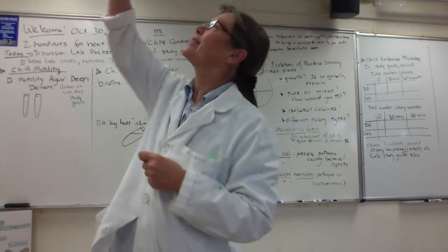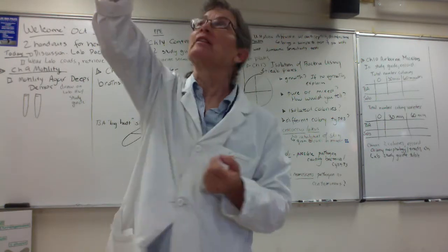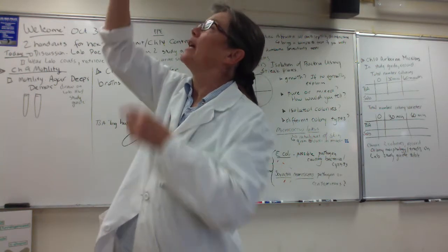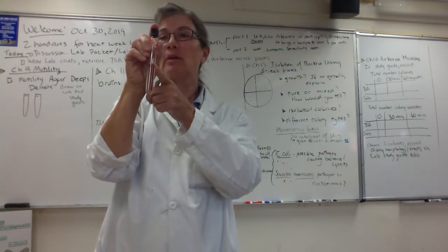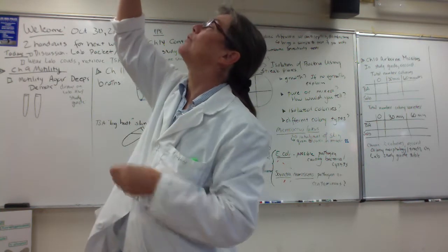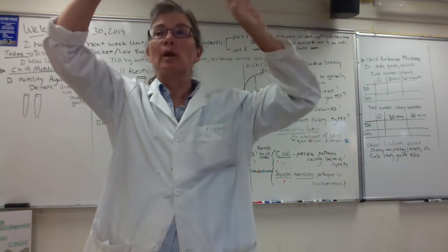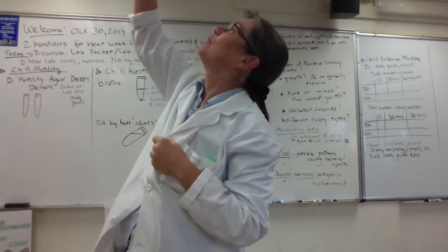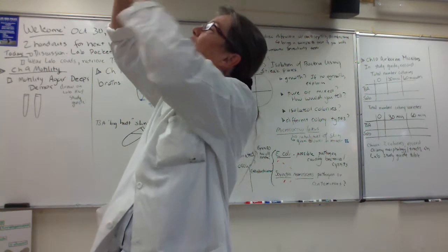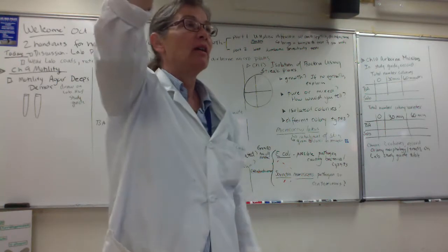But with regard to the Motility Agar, what I would suggest, if you were actually running this test, is you hold it up to the light. And of course, you're going to have nice red color along the stab line where the microbes are growing. But what you're looking for is diffusion of the red into the surrounding media. Because remember, wherever the red is, the bacteria are. And so by holding it up to the light, you can see that the bacteria are moving away from the stab line into the agar itself.